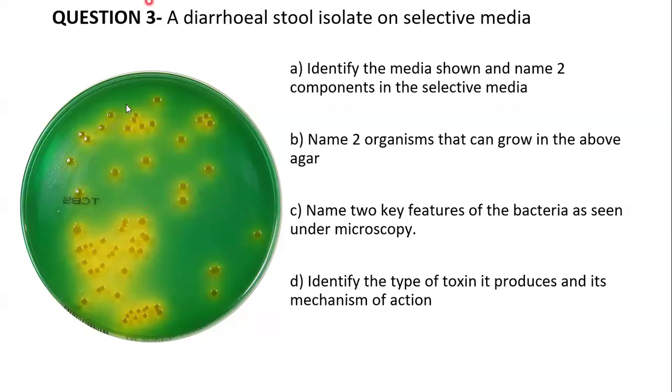Who knows? TCBS, very good. Thiosulfate, citrate, bile salts, agar. Then what are the components? So you've already mentioned the components. What are the components?